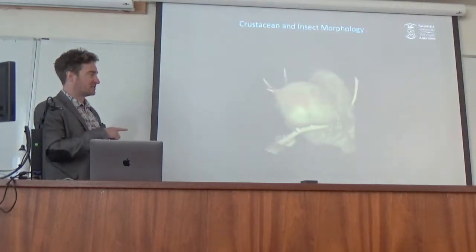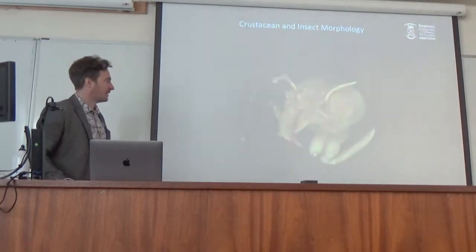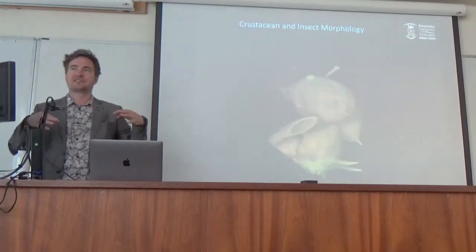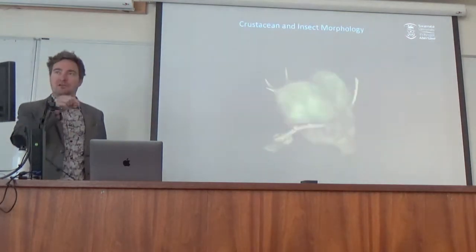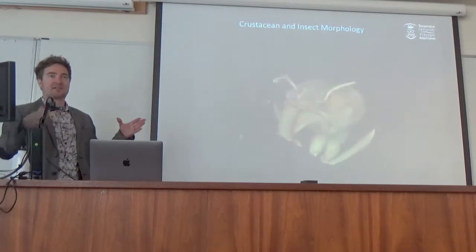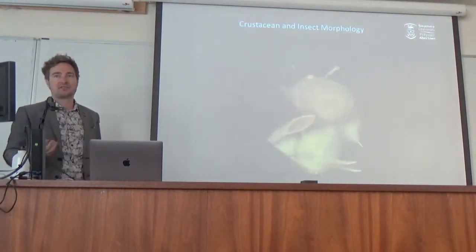And this visualization software is my favorite, and I will come to that later. And we can isolate, you can just about see the tips of the mandibles of the leafcutter ant are highlighted red because they have a higher x-ray attenuation. That's related to zinc entrainment along that surface. So the zinc gives different materials properties. It's like having a tipped knife edge, effectively. And we can see that within x-ray.